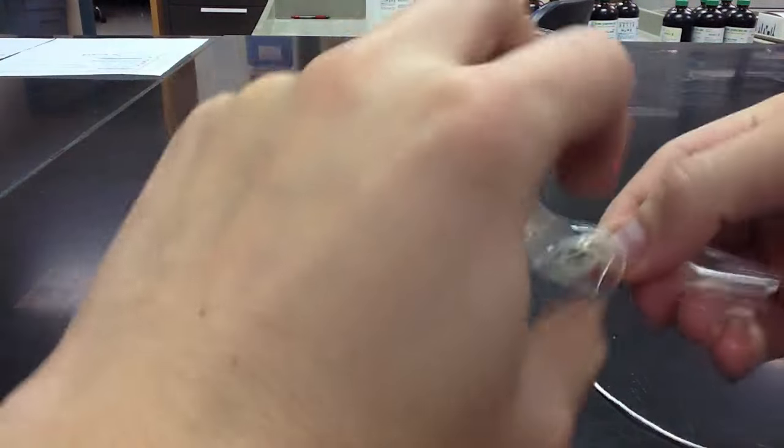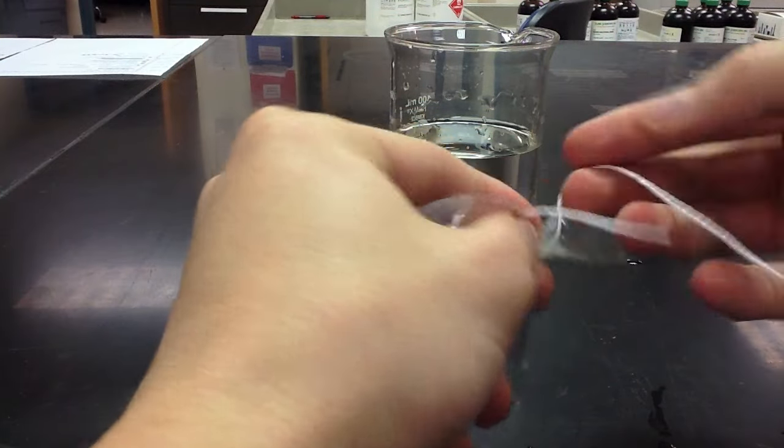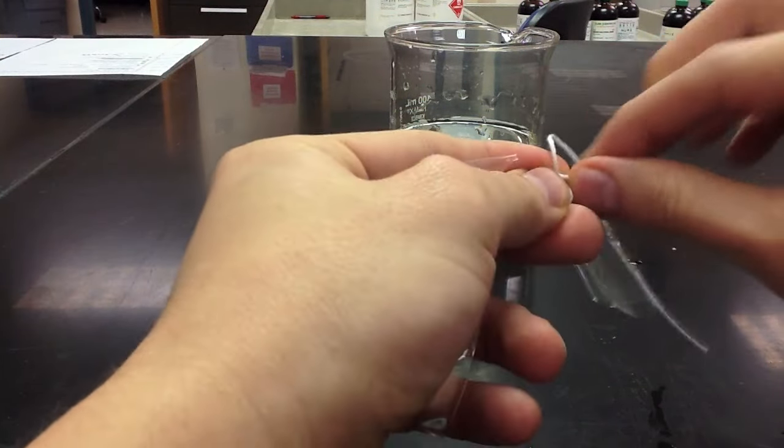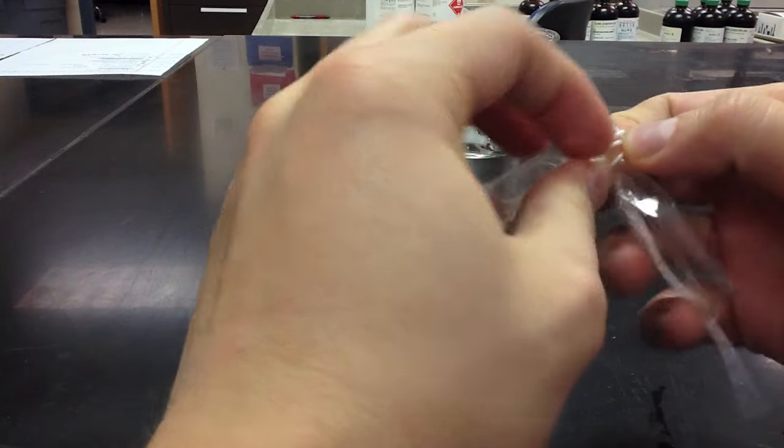Initially, what you'll want to do is twist your dialysis tubing on one end and then tie that end off with a piece of string. Make sure it's a good snug fit for the knot so that no liquid can actually seep out of this end at any point in time during the experiment.